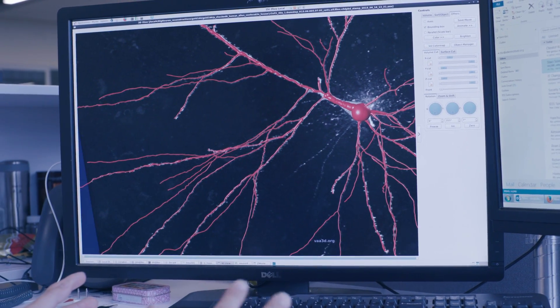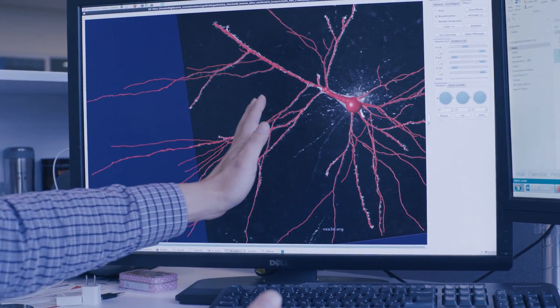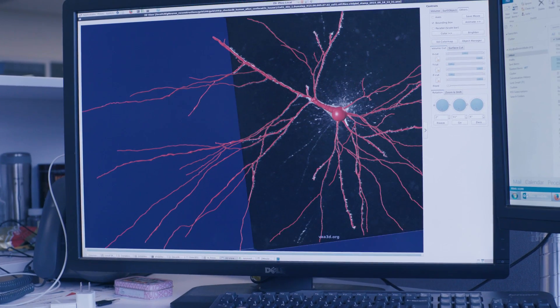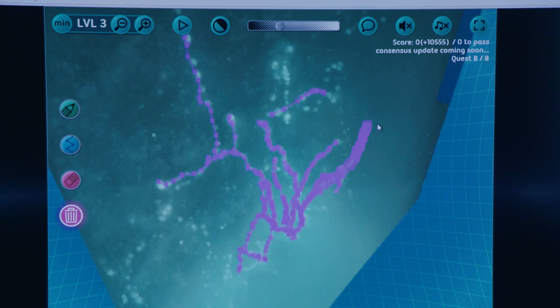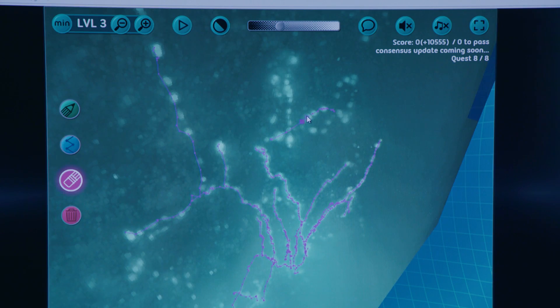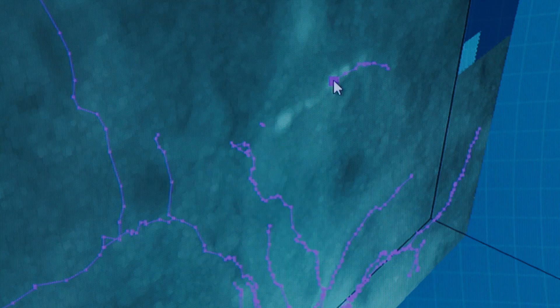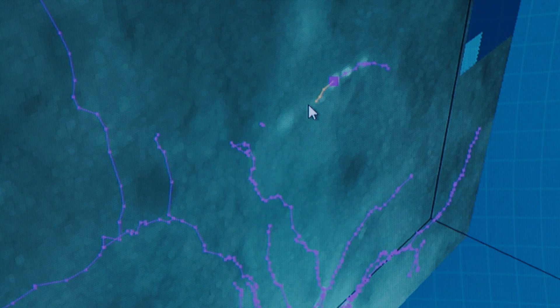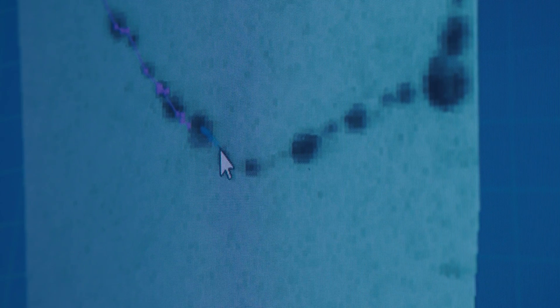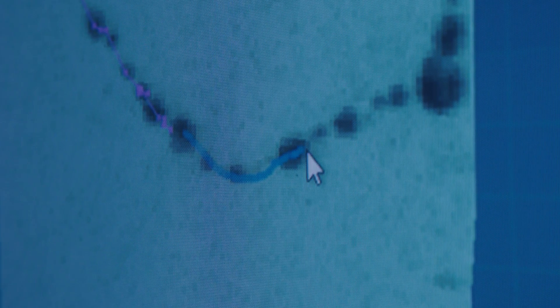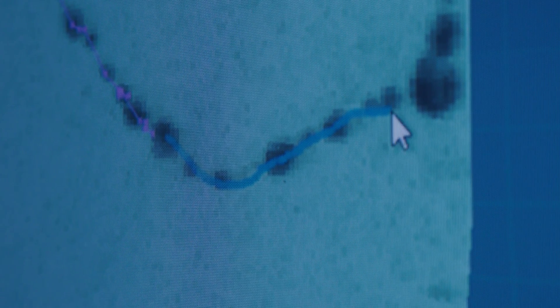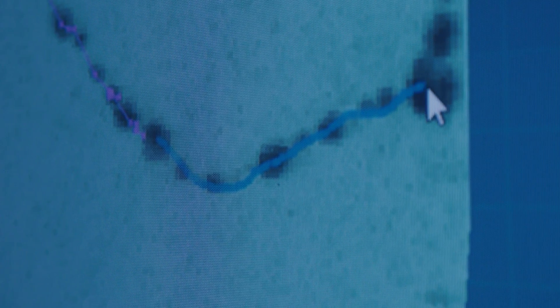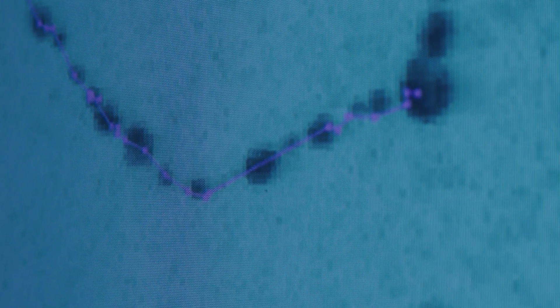We have some really great software, Vaa3D, with a Mozac user interface where we start with an automated tracing of the neuron that's generated by an algorithm. Then using that same tool we can add to that neuron using semi-automated reconstruction where we basically draw a branch and then the computer will figure out where within the three-dimensional space of the image that drawing should go.